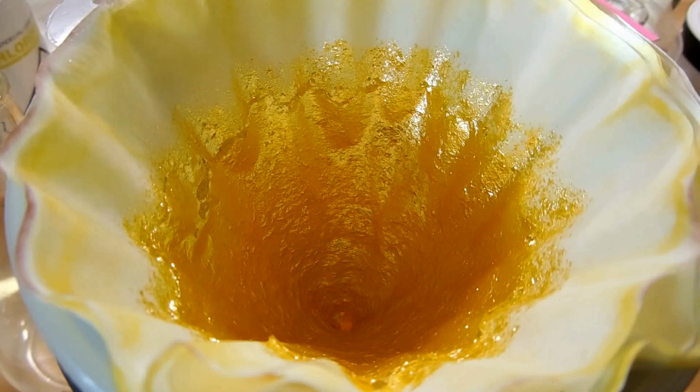All filtered and dried, this stuff actually looks really nice on the filter paper still. So I'm going to very carefully scrape this off with a spatula and transfer it to a vial for storage.